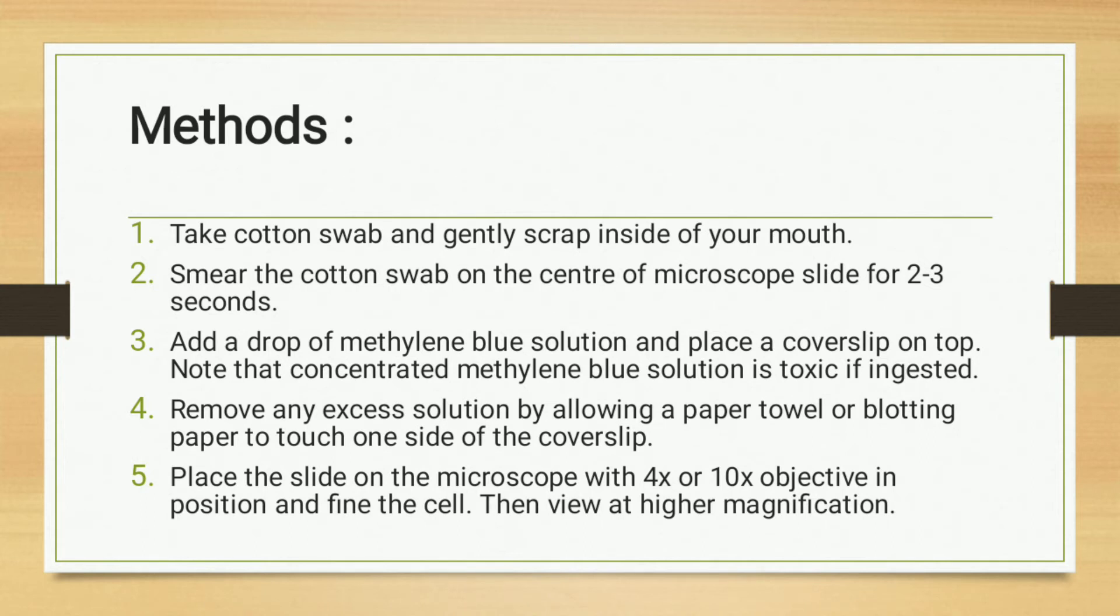Note that concentrated methylene blue solution is toxic if ingested. Remove any excess solution by allowing a paper towel or blotting paper to touch one side of the coverslip. Place the slide on the microscope with 4x or 10x objective in position and find the cell.